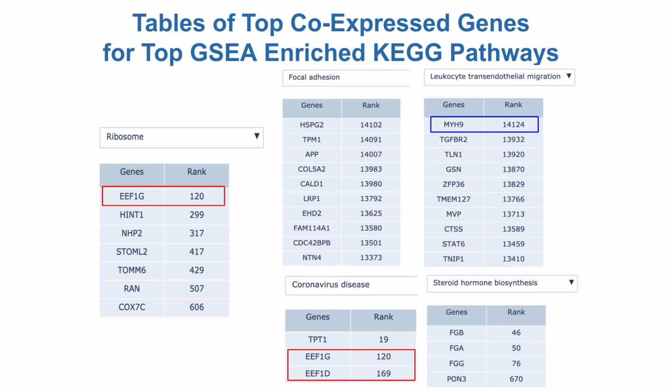These are the tables for the case study's top co-expressed genes, and the tables all show up to the top 10 genes. Some of the gene sets have fewer than 10, which implies that there are not many genes missing from the original pathways. These co-expressed genes are predictions made by the Appyter for genes that play a role in the pathway but were currently missed in research. With these results, we can analyze if these genes have connections to the pathway whose genes they were added to. The highlighted genes in red and blue will be talked about on the next slide.